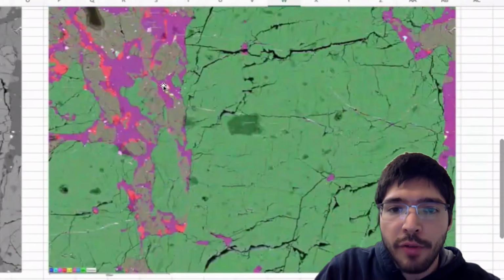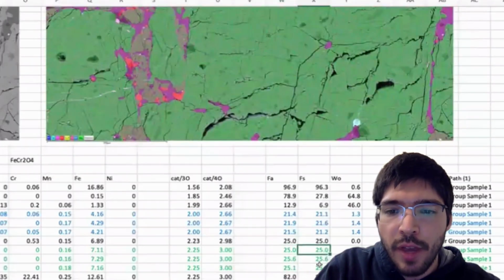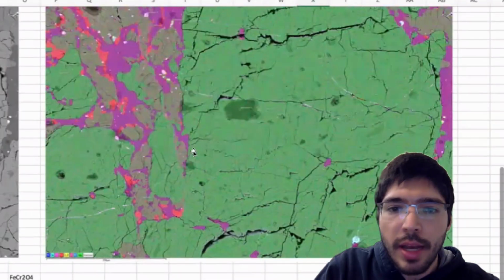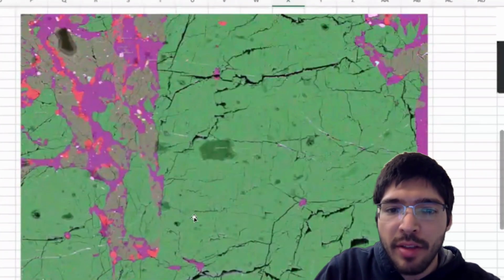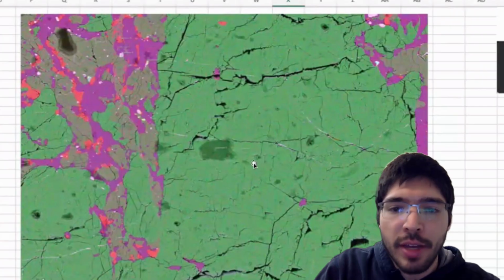For the low calcium pyroxene, which is this dull green, we can see that it's very similar, and this one right here, and the ferrosilite and wollastonite content, so it's also equilibrated. Based off of the texture right here, I'm not seeing evidence of zoning. I'm not seeing evidence of different chondrules that have different chemistries, right? And I'm seeing very large feldspars, right?